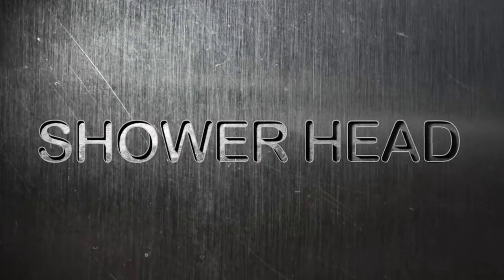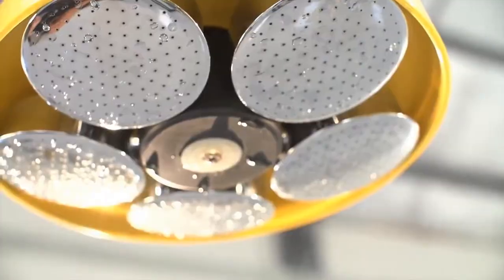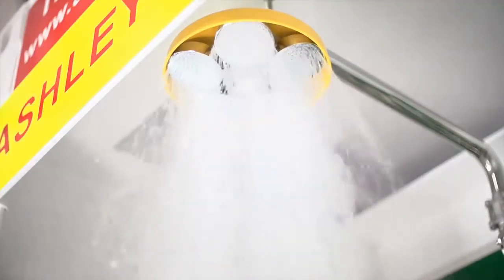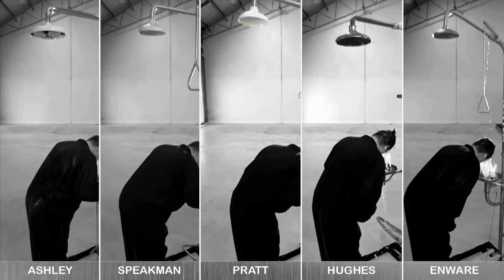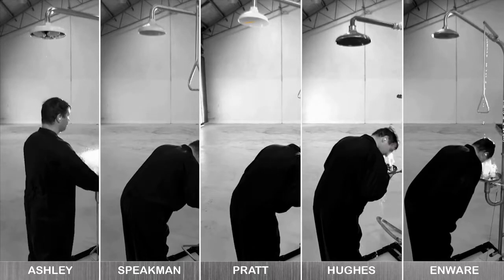Shower head. Ashley's shower utilizes a multi-head design which gives a smooth, consistent flow that covers the required area better than single head designs. In order to examine the shower head effectiveness more closely, we've prepared a simulated chemical burns test to show you just how effective this design really is, and how ineffective some designs can be.